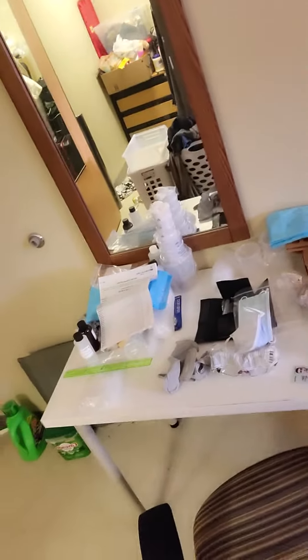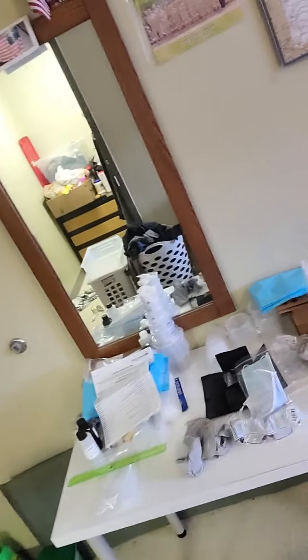The location that I will be performing the lab will be right here on this table. Why is it safe? It's because first of all, there's nothing underneath here, and this entire table will only be used for the lab materials.